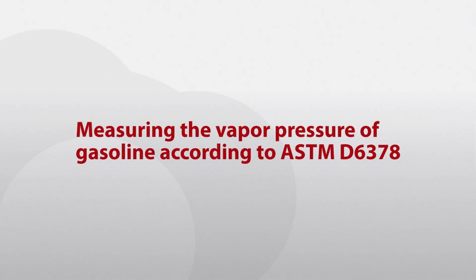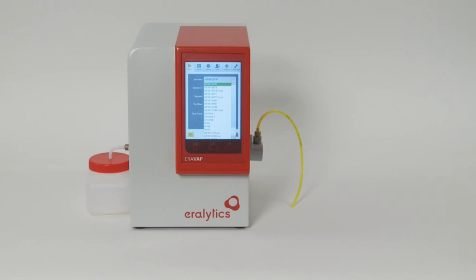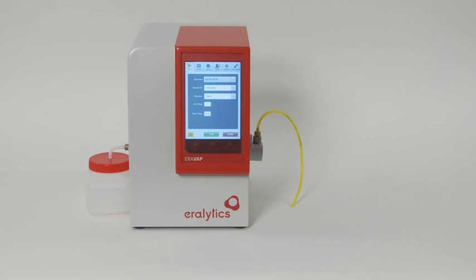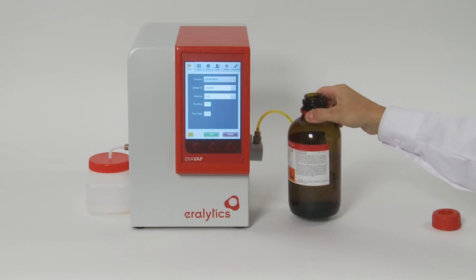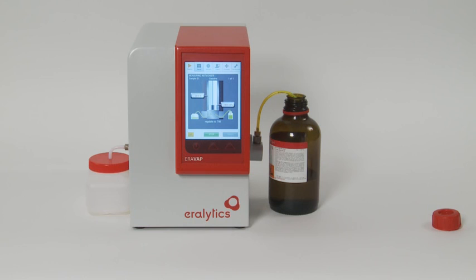Measuring the vapour pressure of gasoline according to ASTM D6378. The latest vapour pressure method for gasoline, ASTM D6378, does not require any sample preparation — you can immediately start with the measurement of your gasoline samples. Select the standard method ASTM D6378 from the first drop-down list on the measuring screen. Enter the sample ID and the operator on the pop-up keyboard or select them from the drop-down list of previously entered names. Open the sample container immediately before the measurement, insert the filling tube and press Run. The instrument automatically starts to rinse and then fill the chamber for the measurement. After a few minutes, the measurement is finished and the result is displayed. The instrument is immediately ready for the next measurement.